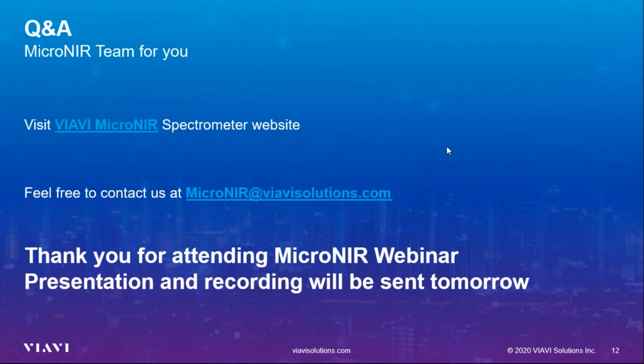I think that we have Maurizio Valleri who raises his hand. Maurizio, you can confirm, open your microphone if you can, or I open your microphone. Okay. Thank you. I want to know if it's possible to connect this apparatus that we have also with a system to stop the blend when the blending is ready.